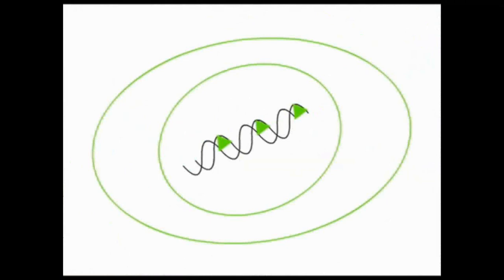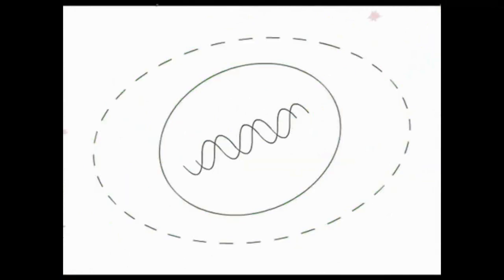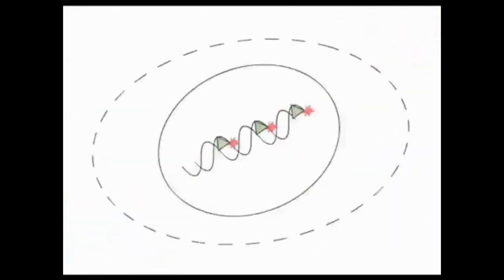PI is excluded from a live cell. Both AO and PI enter a dead cell through the damaged cell membrane and bind to its DNA. Under blue excitation, the green fluorescence by AO is absorbed by PI, producing an extremely weak green signal.